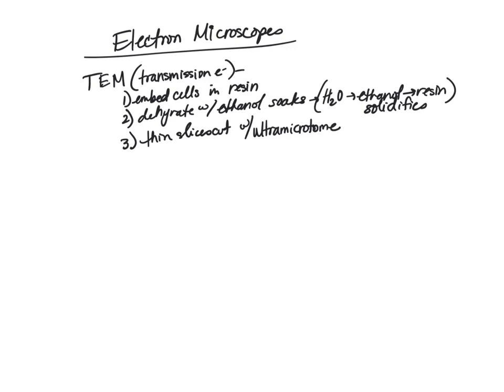Once we cut those very thin slices with the ultramicrotome, the samples are going to be fixed to copper or carbon grids.